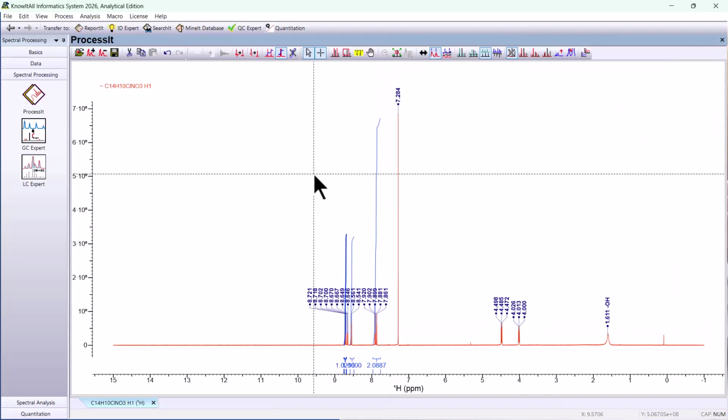Now, the benefit of adding a spectrum to a user library is it would be a home to all of your processed data so that when you are ready to look back on your NMR spectra, you always have access to the cleaned up version of your spectra. And this also means you can always locate them. So I'm going to use this option here.